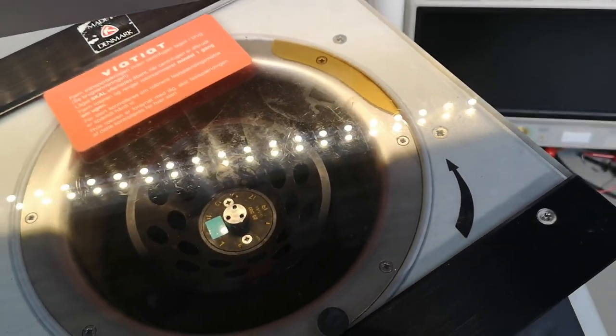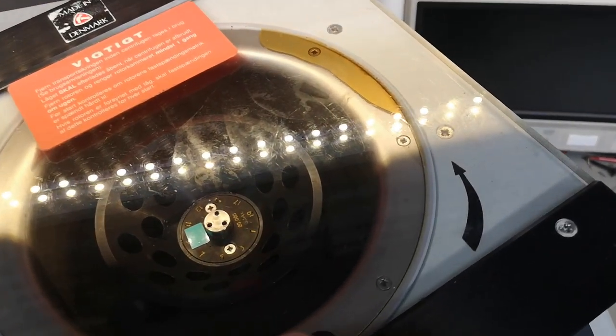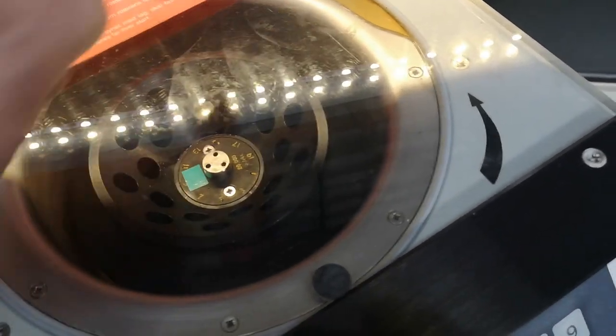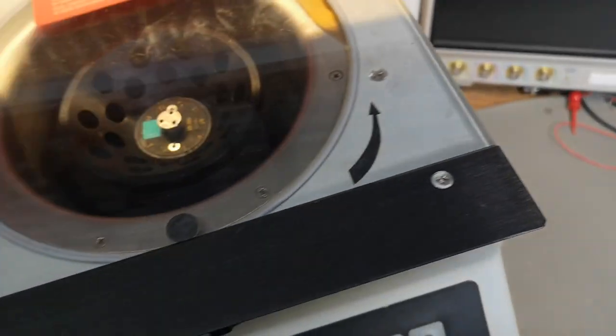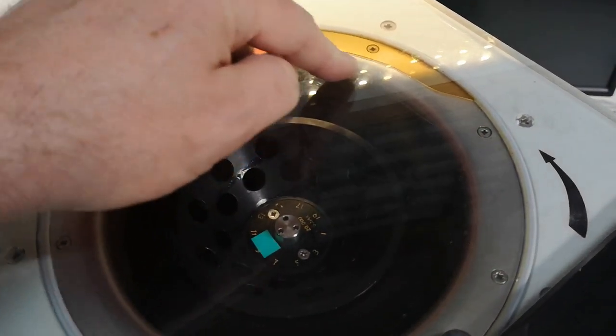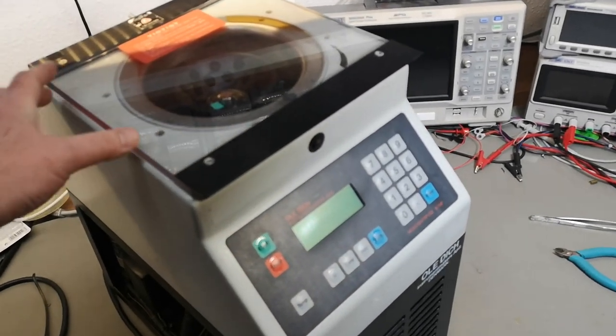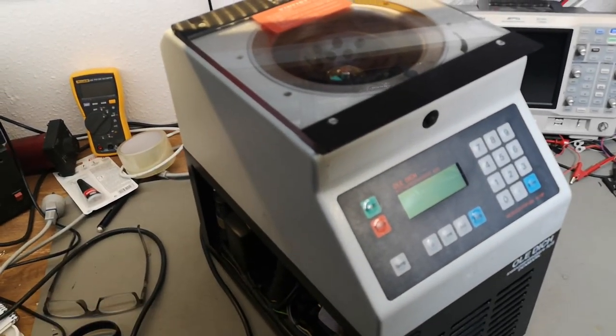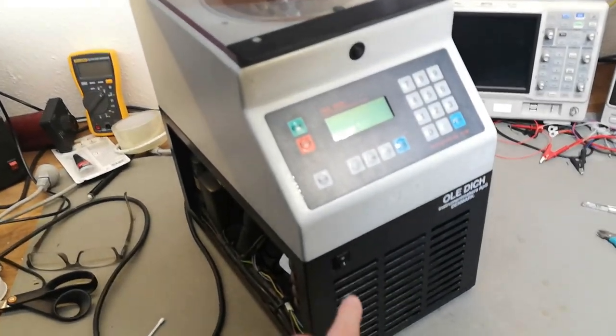Oh no — bad words! Look at that kind of yellow puke after I had this thing lying on its side. I got some leakage — what is that, cooling fluid? Nasty stuff. This can't be good. I need to open the lid to get access to those screws so I can lift up the cover. I need to power it up real fast and see what happens — let's hope the new switch works.